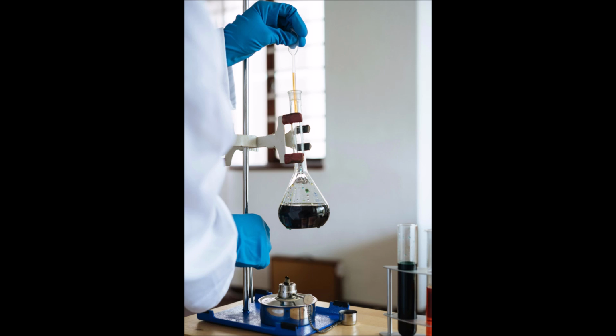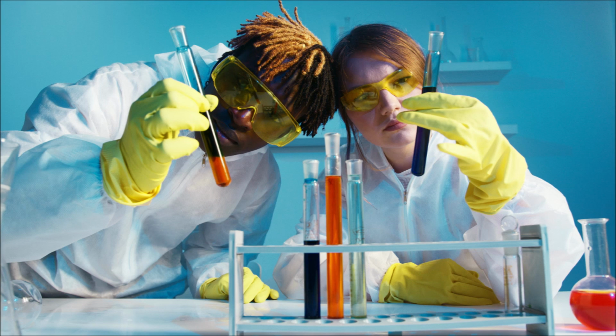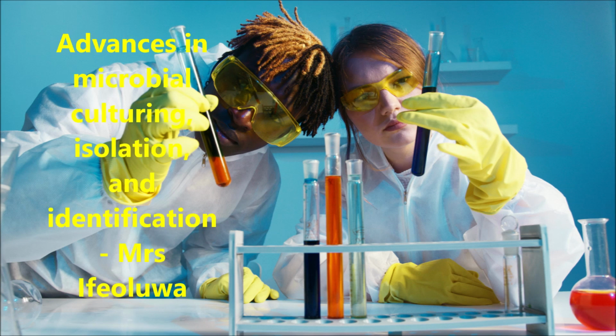In conclusion, advancements in microbial culture, isolation, and identification have made the process faster, more efficient, and more comprehensive. The shift towards molecular and high-throughput techniques allows for the identification of unculturable microbes, improving our understanding of microbiomes in health, industry, and the environment.